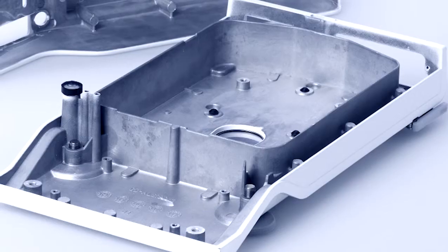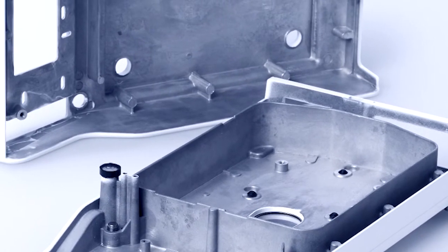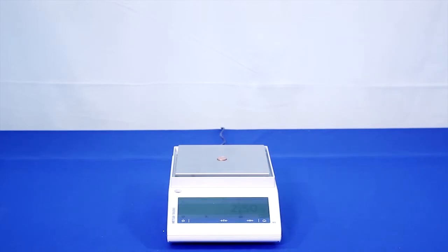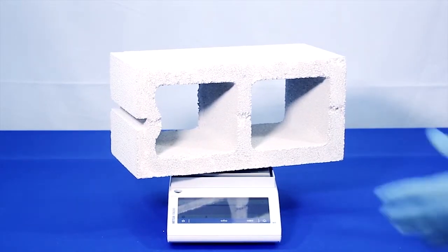We've maintained the balance's full die-cast aluminum housing, which makes for a durable and long-lasting product and is also resistant to harsh chemicals like acetone. In addition, the monoblock weighing cell provides solid overload protection no matter what finds its way onto the balance.